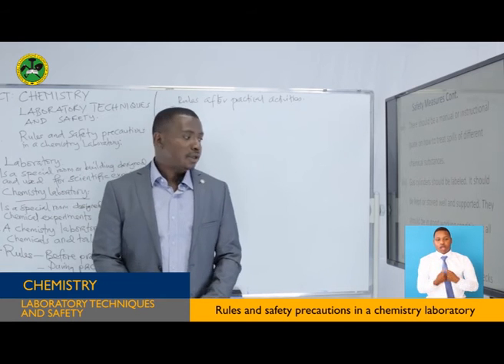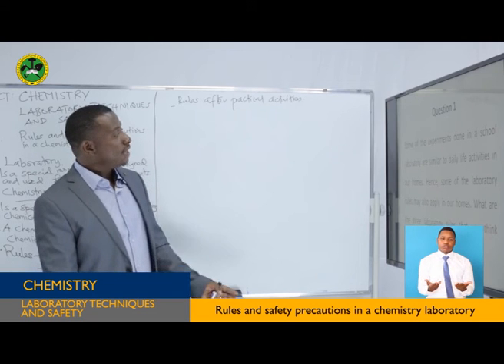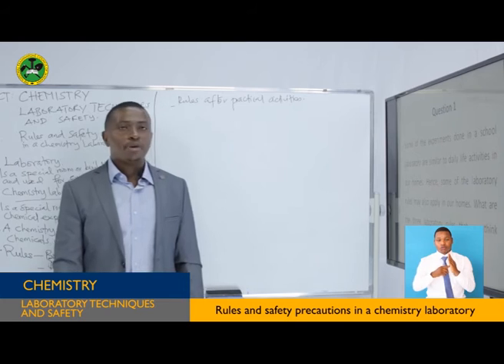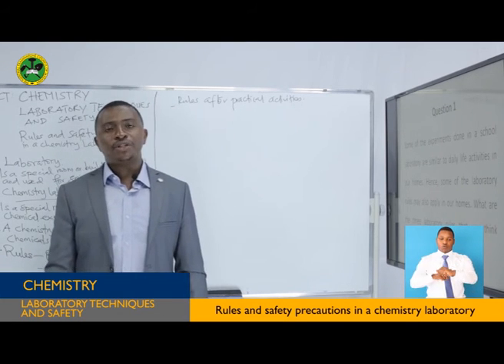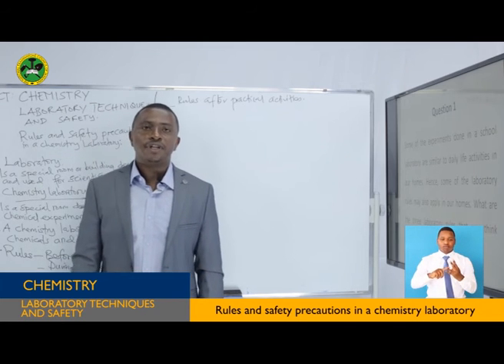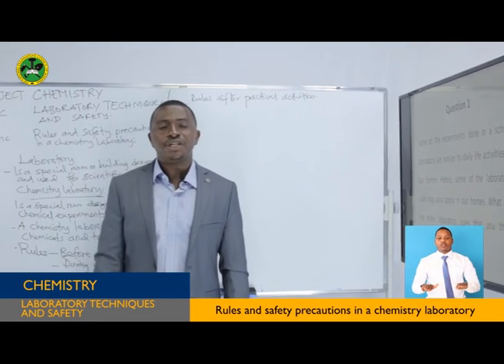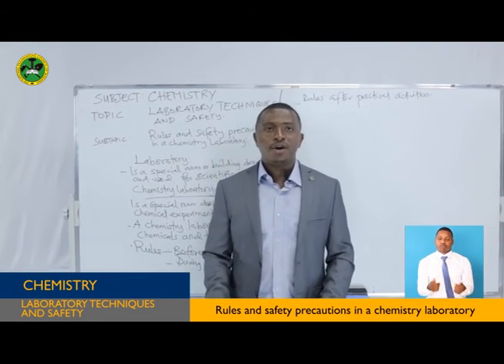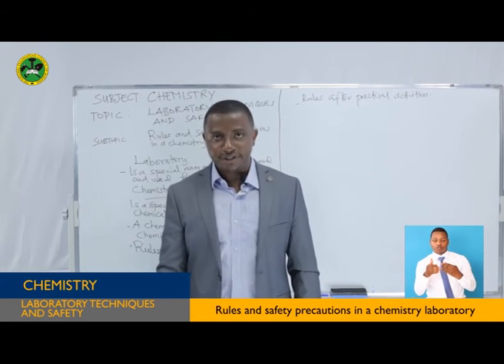Dear students, we have discussed a lot on the rules before doing a practical activity, rules when doing a practical activity, rules after doing practical activities, and the safety measures that should be taken within the laboratory. Now, I hope that you are aware of how to work in the laboratory safely.